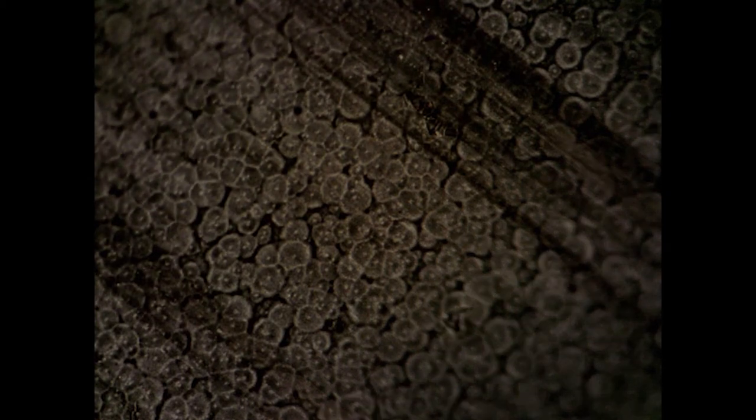Okay, so we're going to start off in the dark area. As you can see, the structures are fairly close packed. Sometimes they're forming a beehive where they're pressing up against one another. Also there appears to be layers of them. You can see smaller or larger ones underneath, piled on top of each other.